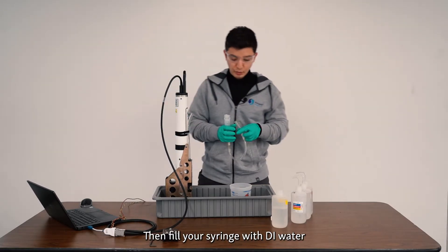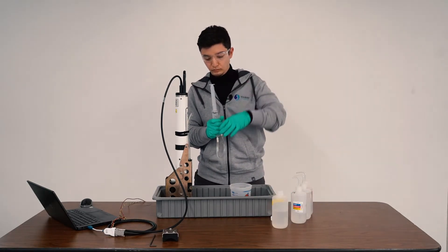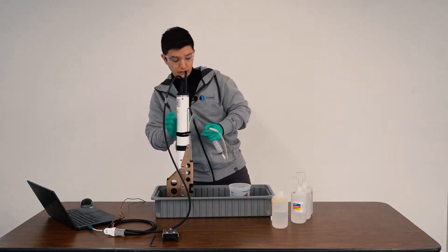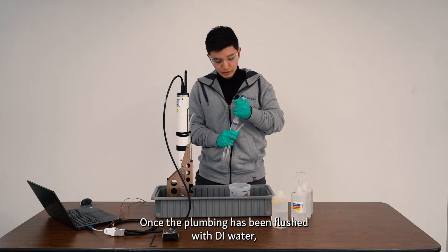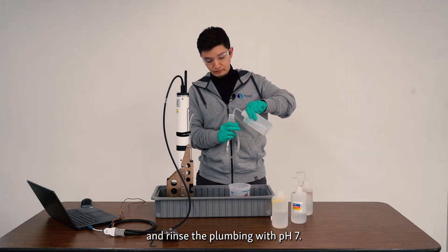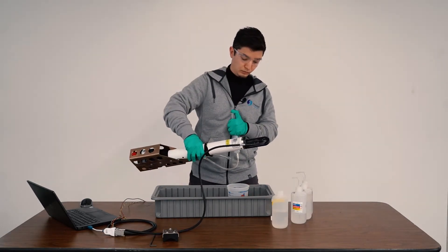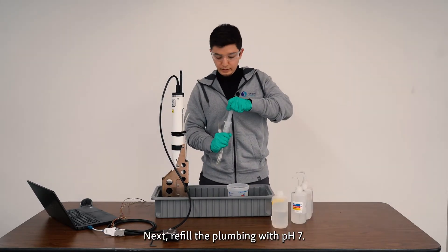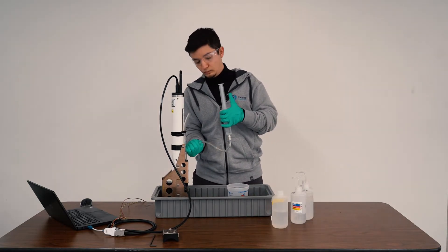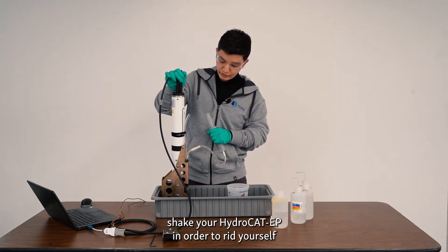Then fill your syringe with DI water to flush the plumbing of pH 4 solution. Once the plumbing has been flushed with DI water, fill your syringe with pH 7 solution and rinse the plumbing with pH 7. Next, refill the plumbing with pH 7, and again shake your HydroCAD in order to rid yourself of bubbles.